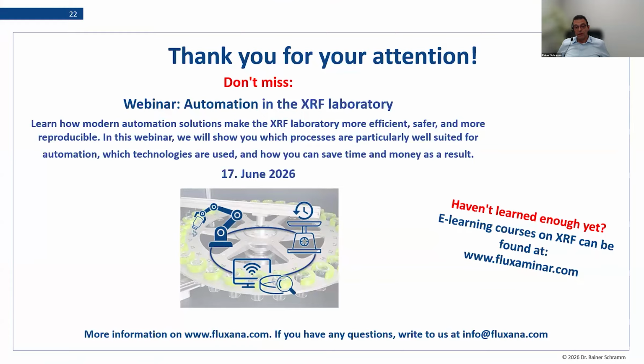evaluation then in XRF. And mostly what we do is a trick: we use oxidizers which include heavy elements like strontium nitrate. Let us assume we use 0.2, 0.3 gram sample and 1 gram strontium nitrate as an oxidizer. The strontium will become a very heavy absorber, and the matrix effects, and also this includes LOI and GOI, don't play a role anymore in analyzing a single element.